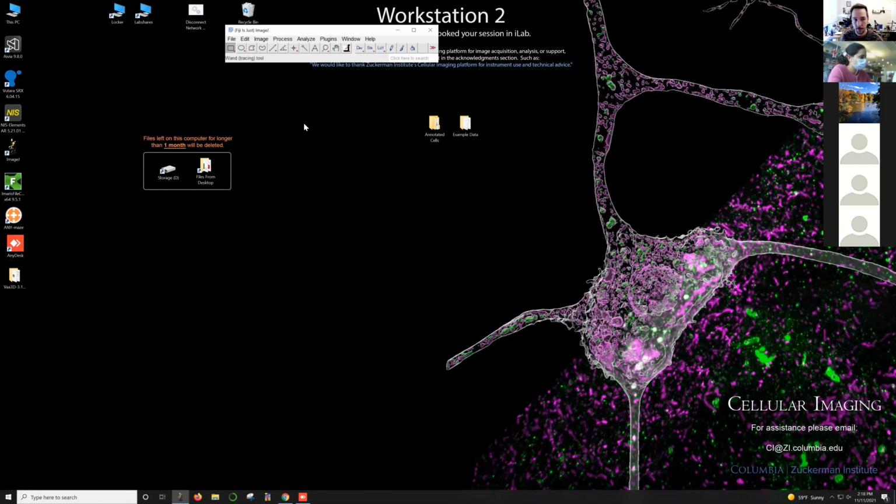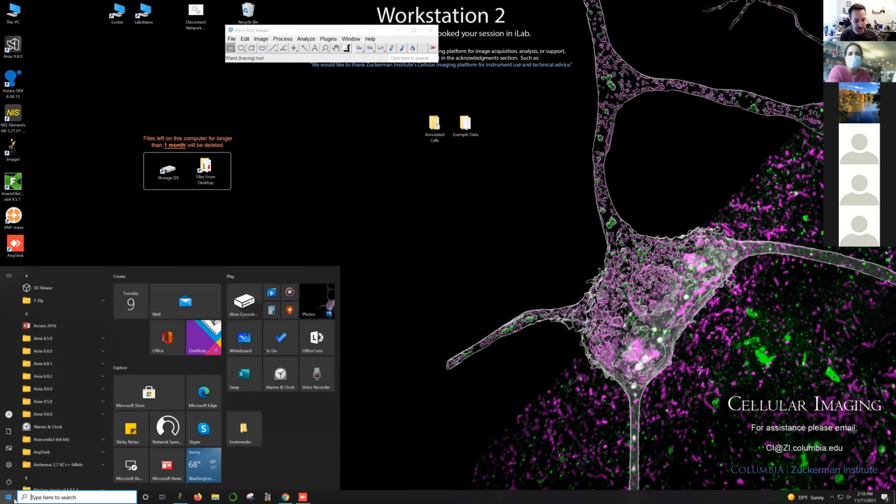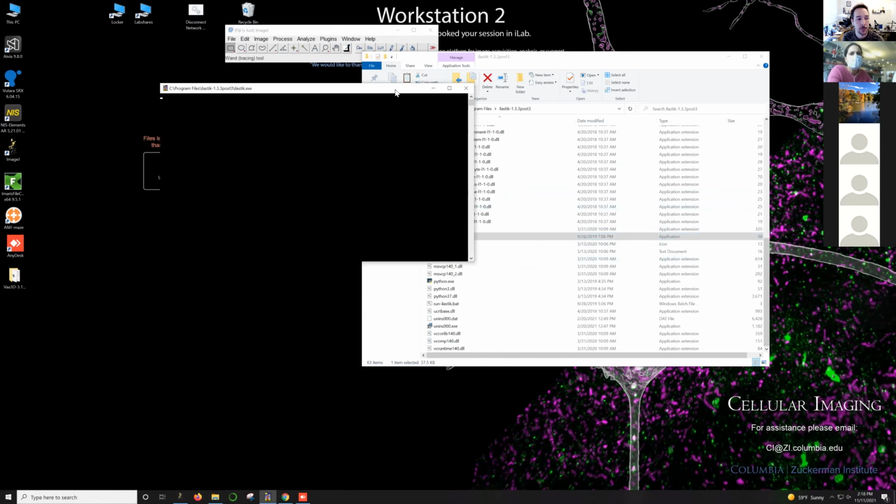And so hopefully if you're trying to follow along, you'll have Ilastik installed. I'm just going to run it here. And just as the first example, we'll actually use those data sets that were captured in brain tissue, because I think for neuroscientists, this is a really common problem in terms of segmenting cells as well as axons and dendrites.